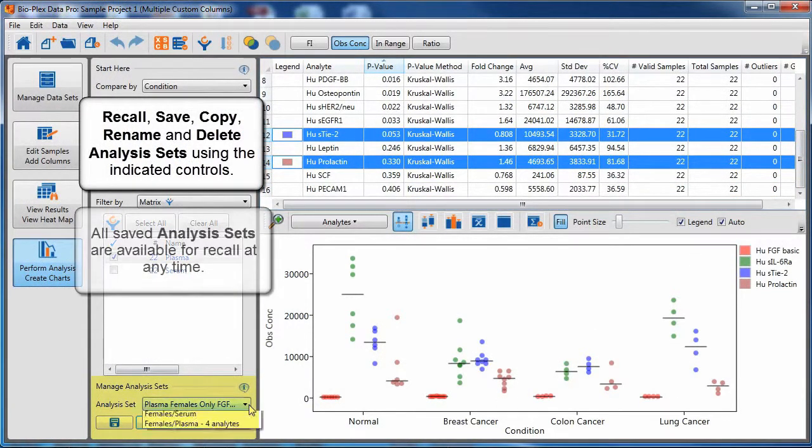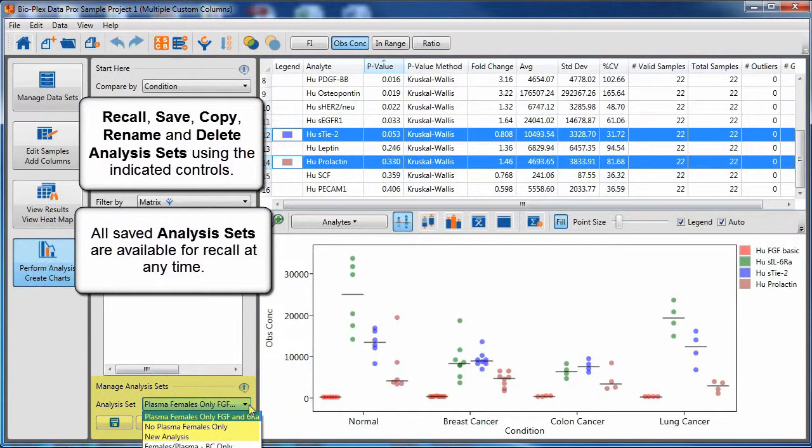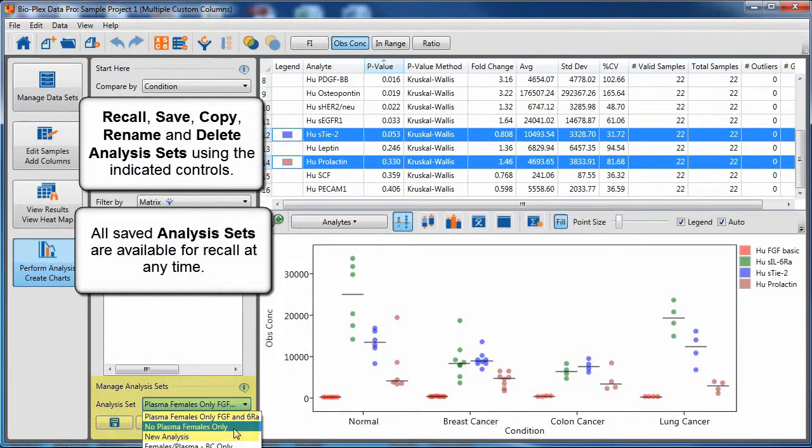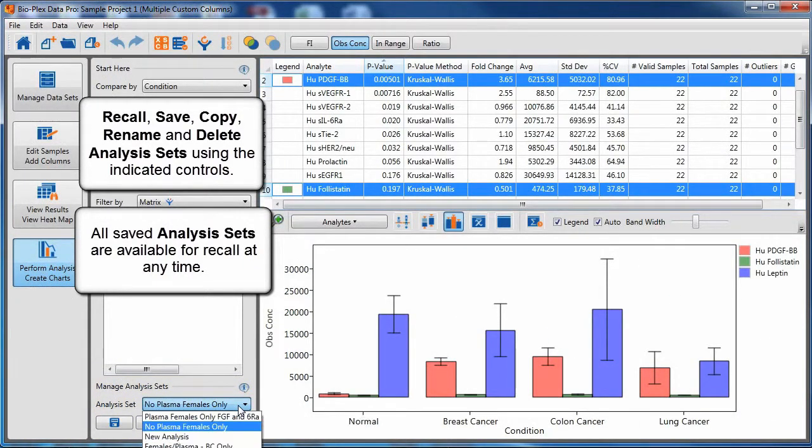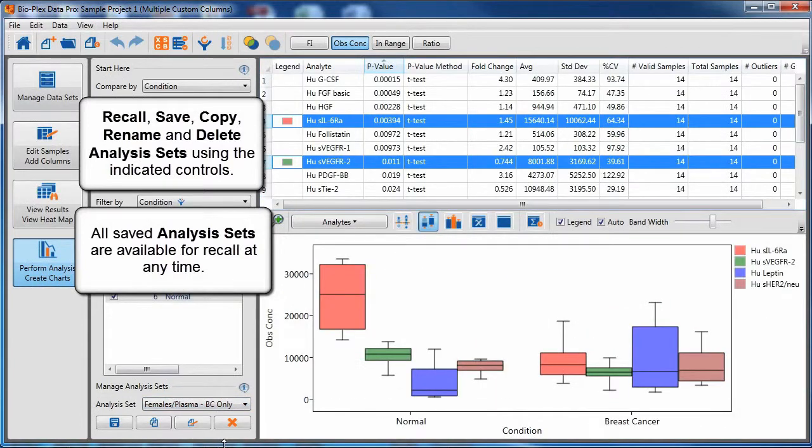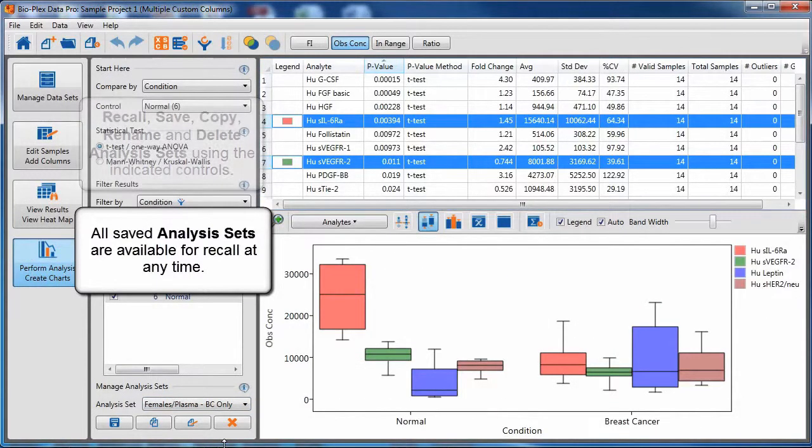Recall, save, copy, rename, and delete analysis sets using the indicated controls on the bottom left. All saved analysis sets are available for recall at any time.